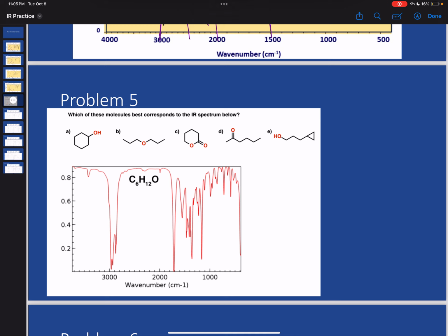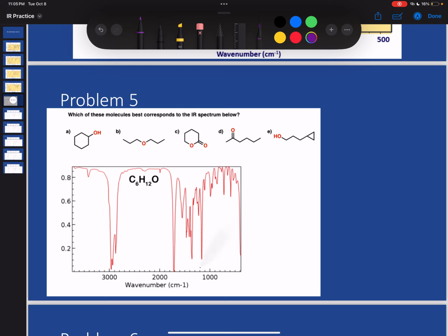So it's a different spectrum. So let's see, 11, 12, 13, 14. So 1500 about right here. So, and then my 2000. So here's my sp2 region. So 1, 2, 3, 4. Here's 5 for sp, and then everything else is our hydrogens. I do see something about 1700, so I'm suspicious that I have a carbonyl.